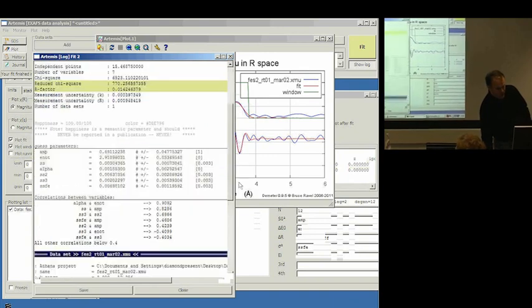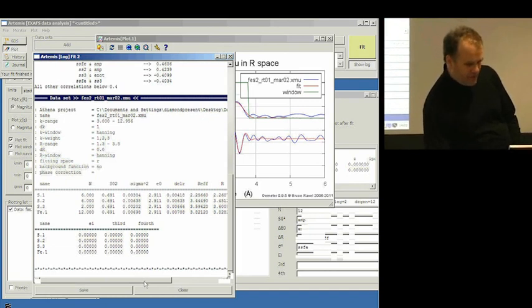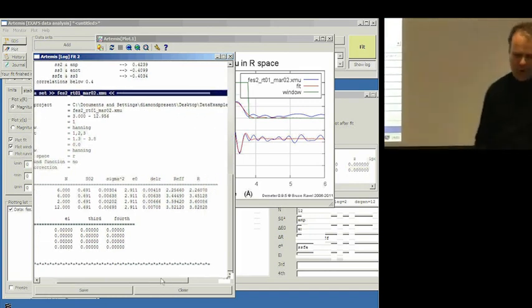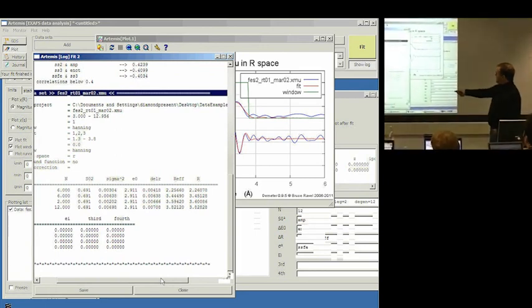If we go down here and look at our 4 single scattering paths, we see that with that value of alpha multiplied in each case by ref, we got delta R, so our refs are monotonically increasing, and our delta Rs are therefore monotonically increasing because of the behavior of this isotropic expansion coefficient. So our isotropic expansion coefficient worked the way we would expect an isotropic expansion coefficient to work. So that's all sensible.